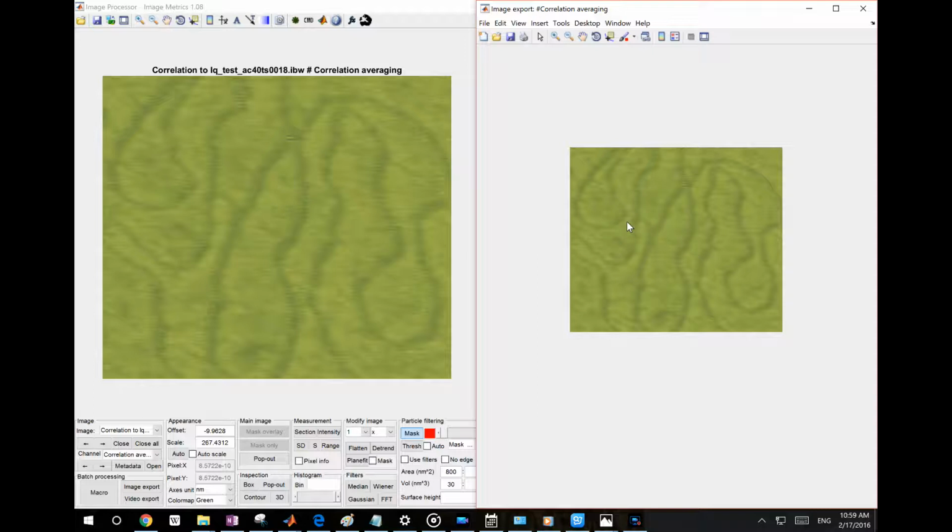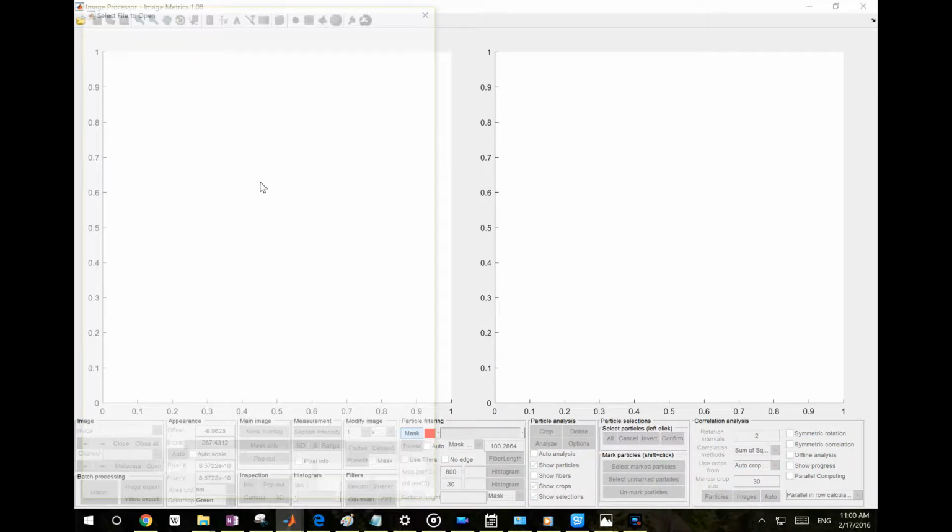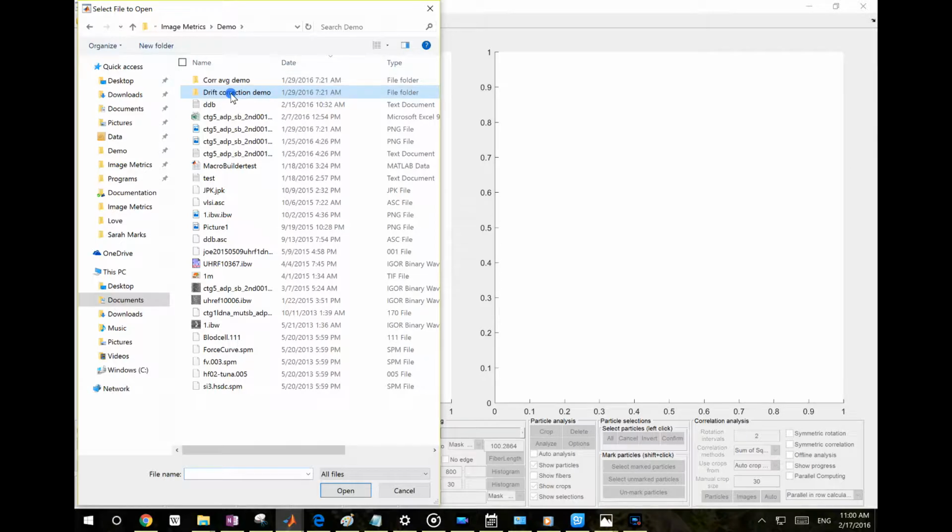The other benefit of using correlation averaging is you can use it to analyze image drifting, so it's useful in solution as well. Sometimes it's the sample that's drifting, sometimes it is the AFM scanner that's drifting, so it's not perfect. You might want to correct the AFM scanner drift, and that's useful, and I'm going to show you in a second example.